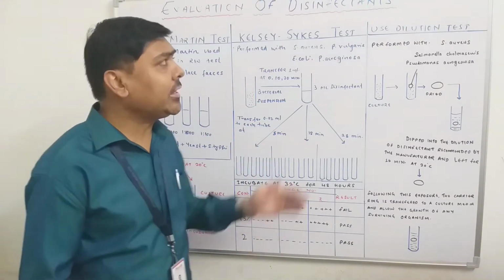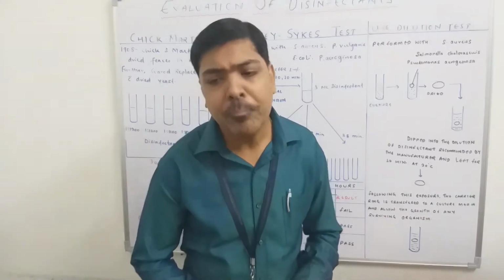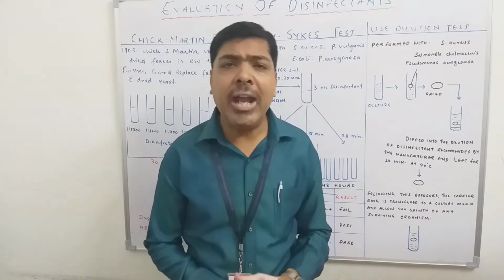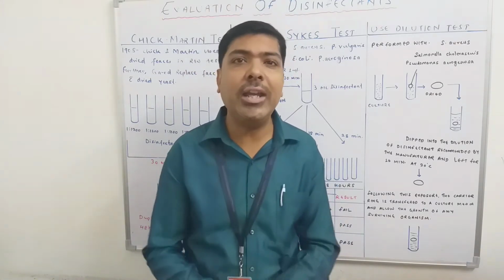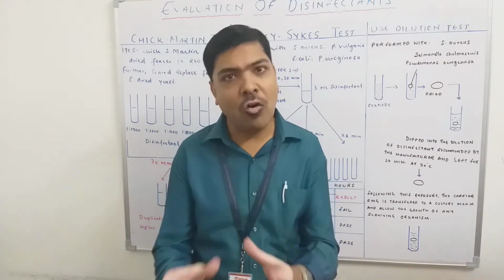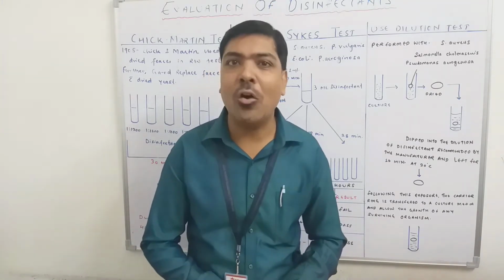Now coming to the third test, which is called the use dilution test. Now we know that there is a lot of research taking place in the case of disinfectants, and every day some new disinfectant is launched into the market. So every manufacturer, before launching it into the market, claims that for the use of this particular disinfectant, this much concentration is necessary or required.